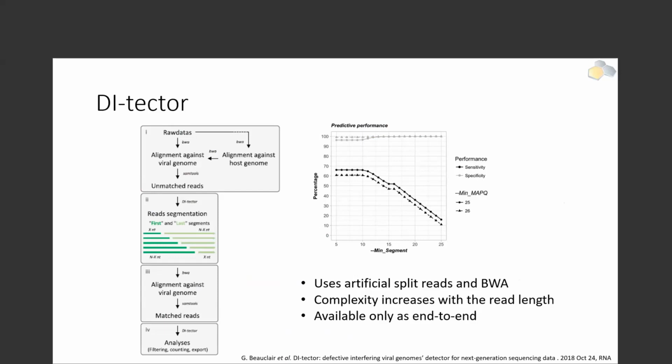Instead of examining all these different alignments of a single read, what they try to do is create multiple sets of one read by taking one single read and splitting it into multiple positions, practically creating all these potential alignments that we capture with that one alignment step, which of course creates a much greater initial data set to work with and slows down the process.